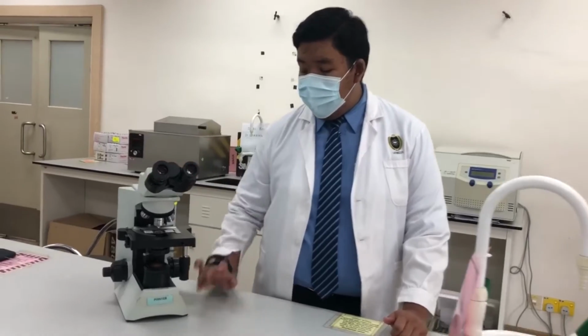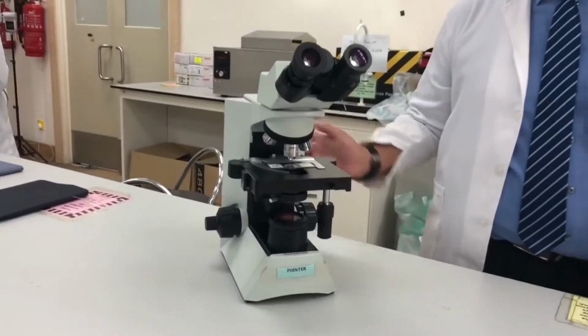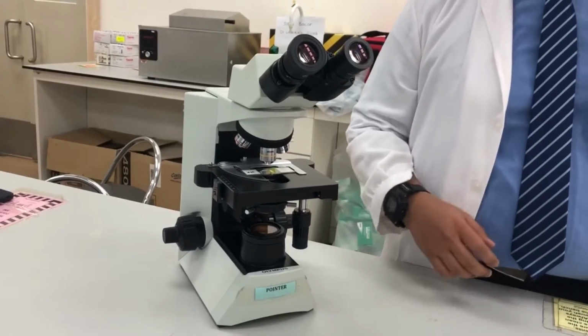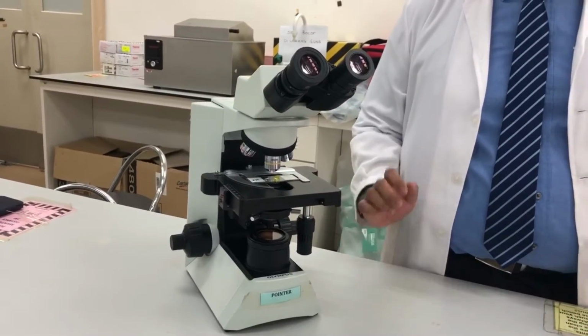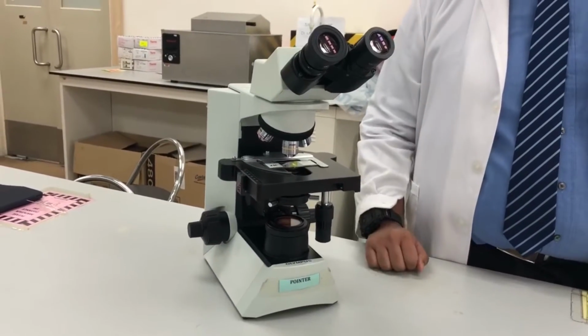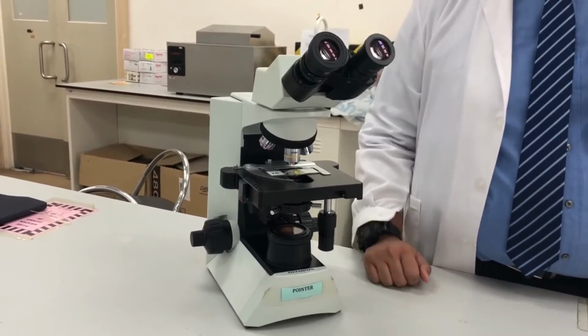Okay, now let us discuss the structural parts of the microscope. There are three main parts in a microscope, which are the head, base and arms. What are their functions? For the first one, the head is also known as the body. It carries the optical parts in the upper part of the microscope. Second one, the base. It acts as the microscope support. It also carries the microscope illuminator.